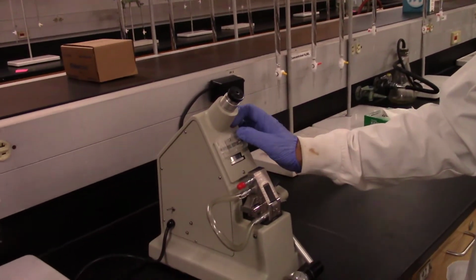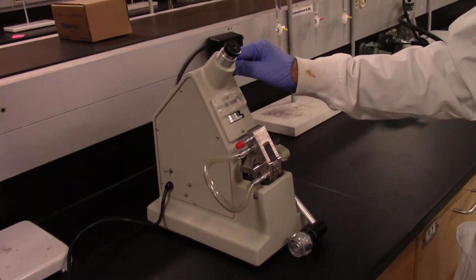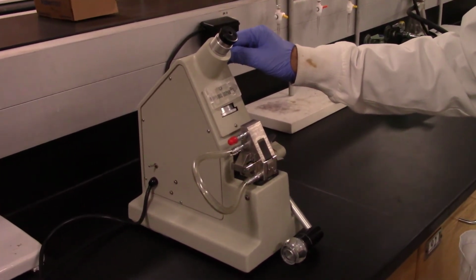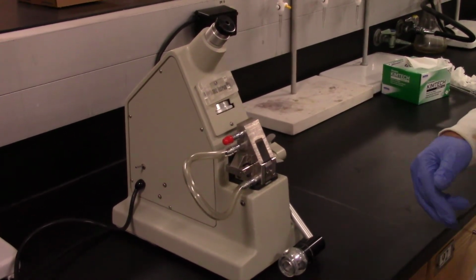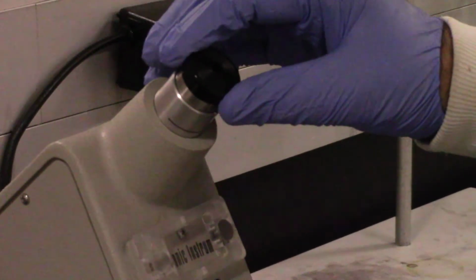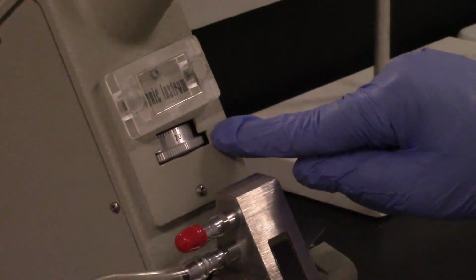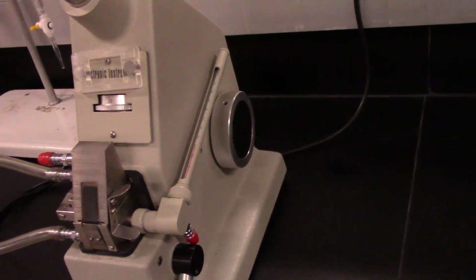Okay, now we are going to measure the refractive index of all the fractions: the first fraction, the second fraction, and the liquid that is left over in the pot. Also, I want to measure the refractive indices of the known solutions, hexane, toluene, and the three percentages that I showed you. Let me describe to you the features of this Abbe refractometer. This is an instrument that measures the refractive index. This is a main knob by which you can adjust a line that meets the crosshairs, the middle point of the crosshairs.